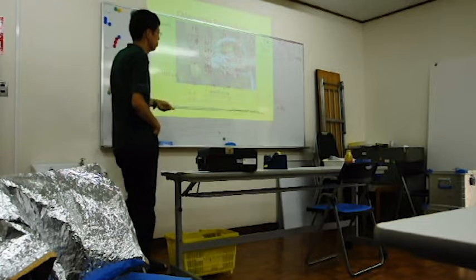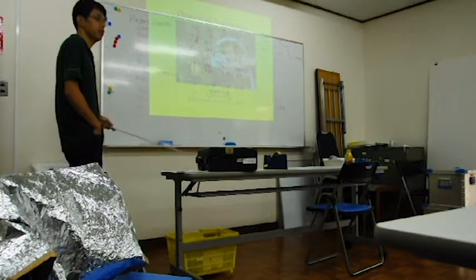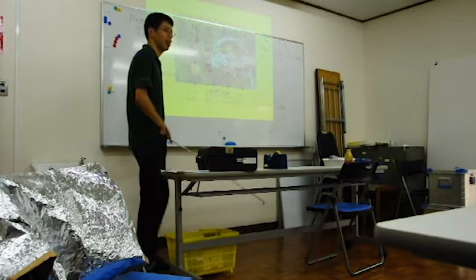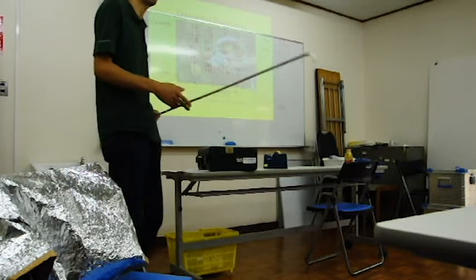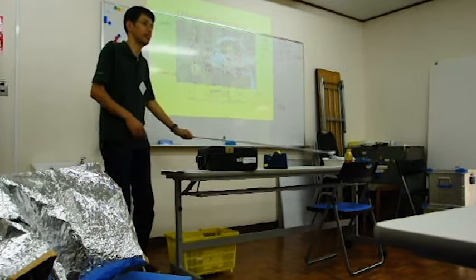FVFM of the Fagus crenata decreased to 0.77. And the initial FVFM of the Magnolia was 0.84, so it's very healthy. And after the light curve measurement, I also measured the chlorophyll fluorescence again and compare these values between the two species, okay?